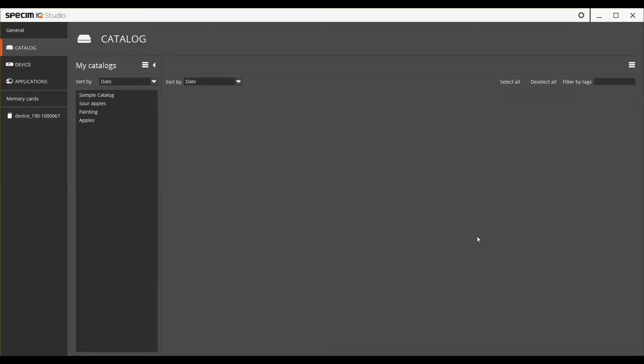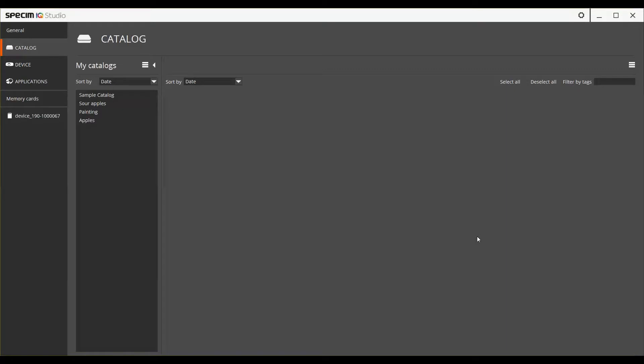First, open up the Specim IQ Studio. Before going to the device view, please make sure that you've connected the Specim IQ camera to your PC with the USB-C cable found in the Specim IQ sales box. Please also make sure that the Specim IQ camera has been switched on. After both of these have been done, move on to the Device tab.